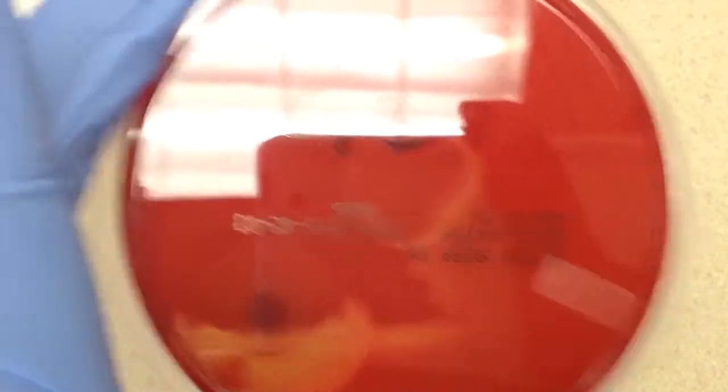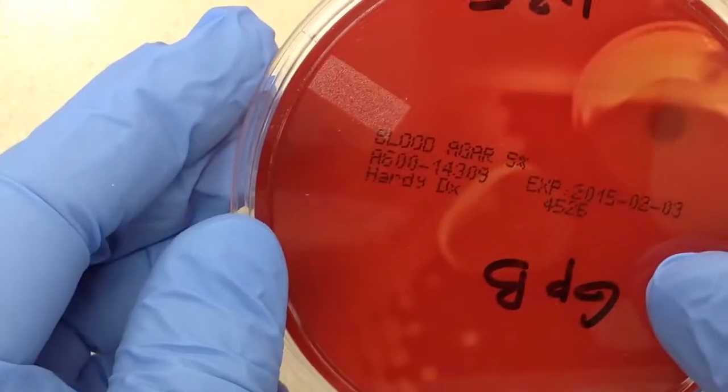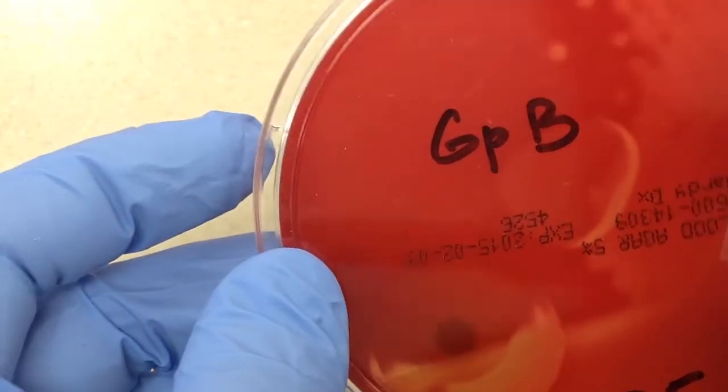The way it's been set up, it's on a sheep blood agar, just a regular blood agar plate, 5%, and it's been set up two ways on this plate.